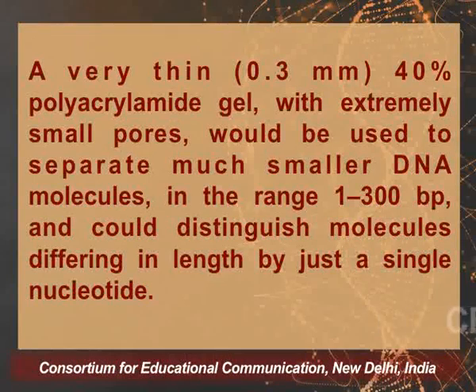Similarly, if you use a very thin, for example, 40% polyacrylamide gel with extremely small pores, it would be used to separate much smaller DNA molecules in the range of 1 to 300 base pairs and could even distinguish molecules differing in length by just a single nucleotide. So, such a resolution, where even a single nucleotide change is detected as a separate fragment on the gel, can be attained if you use a higher concentration of gel, and therefore a material which can form such higher concentration gels, and a very, very thin gel.